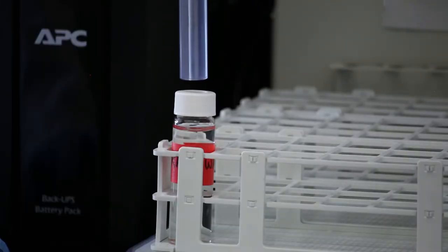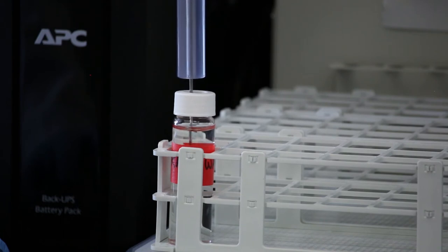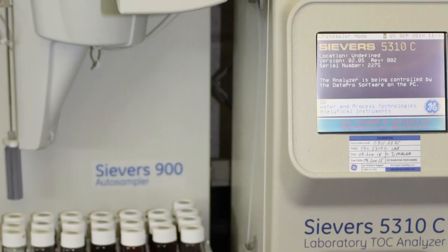The TOC analyzer draws the water sample through a needle and oxidizes organic carbon into carbon dioxide. The carbon dioxide is quantified by measuring conductivity.